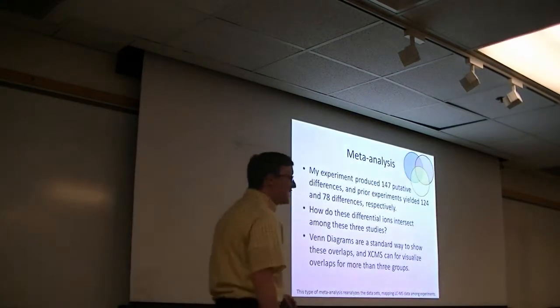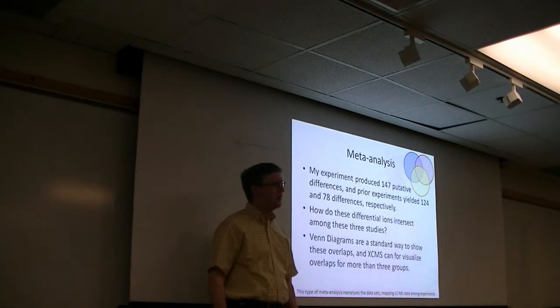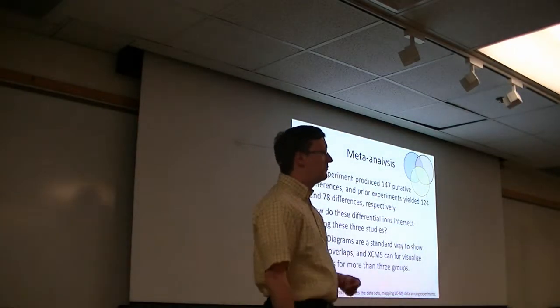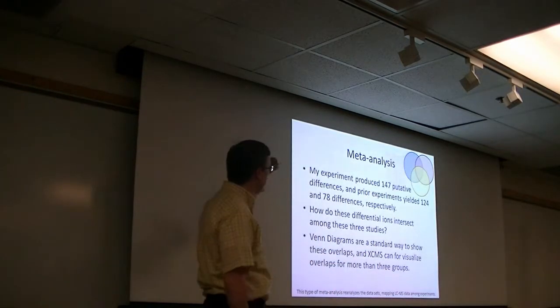All right. Now, meta-analysis is a huge and somewhat controversial area, actually, because there are lots of ways in which trying to combine information from multiple studies can get you in a lot of trouble. Meta-analysis within XCMS has given you quite a few ways to go.